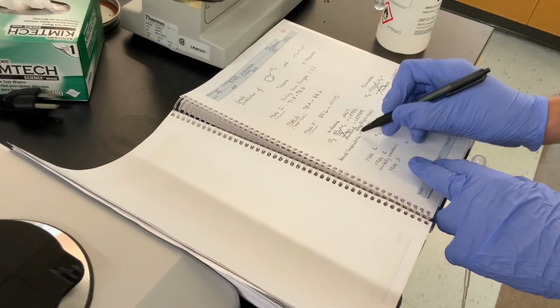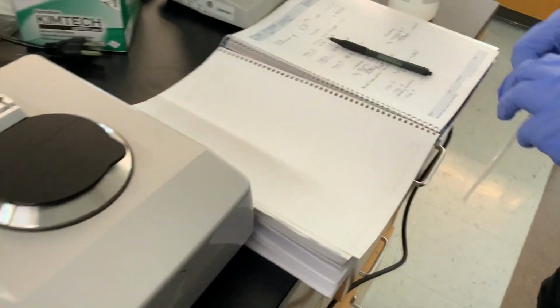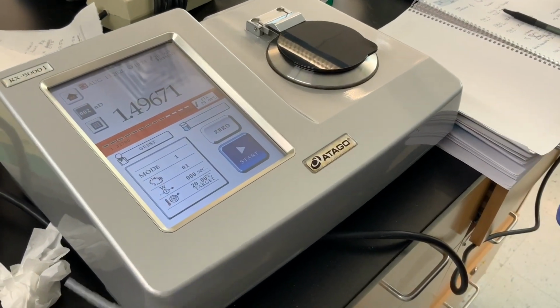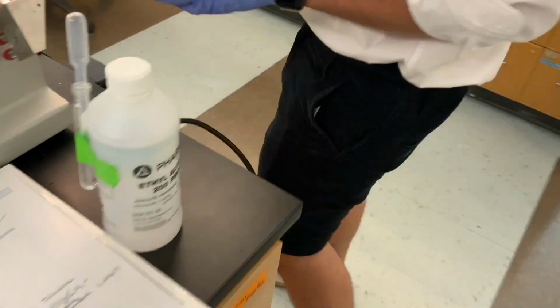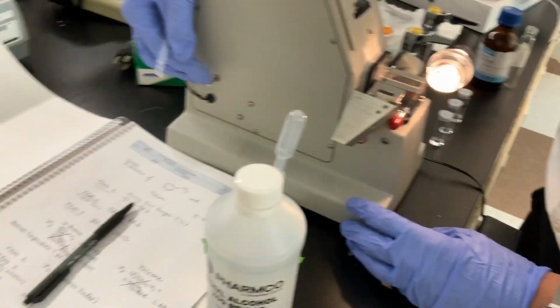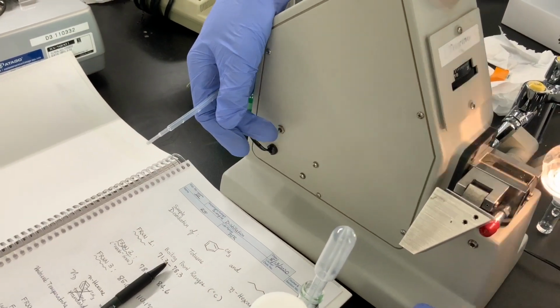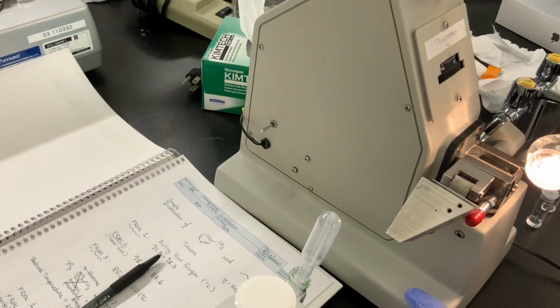So this was with the digital one, and now we're going to take it again with our analog version of the older Abbe refractometer. So it's still on over here. And by the way, this was the knob that I chose to first turn on the instrument, to have the light on it. And then once you have the light, you see those crosshairs.